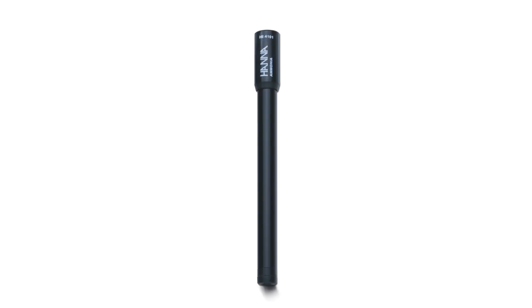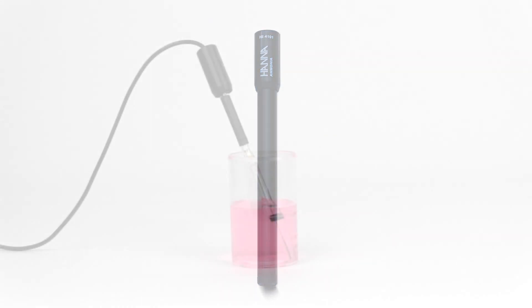As long as the slope value is acceptable, the ammonia ISE can be reassembled and is ready for calibration and measurement. If you have an unacceptable slope, try reconditioning your electrode.